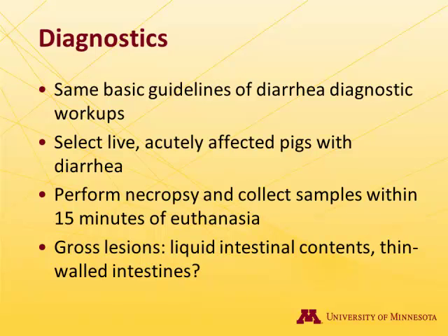Just as an example, we did some inoculations of pigs, and we inoculated PED into pigs. In 24 hours we were seeing diarrhea. We euthanized pigs in 48 hours. We had positive controls, negative controls. And I thought, well, I'm going to take pictures of these gross lesions, and I'll be able to capture the thin-walled intestines. Well, it didn't really work. Those pigs that had a lot of virus, they had diarrhea, they had very low CT PCRs, they basically didn't have the clear thin-walled intestine. So I'm not saying it's not a valid observation. I'm just saying be aware that it might not be there.